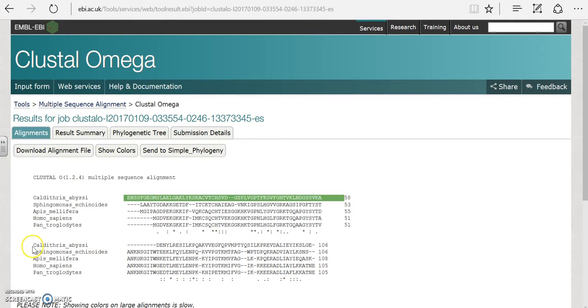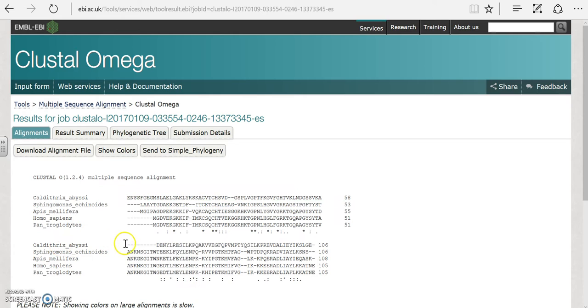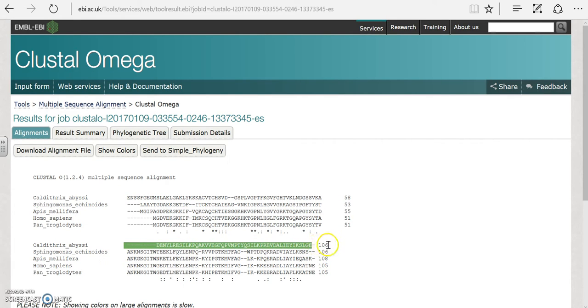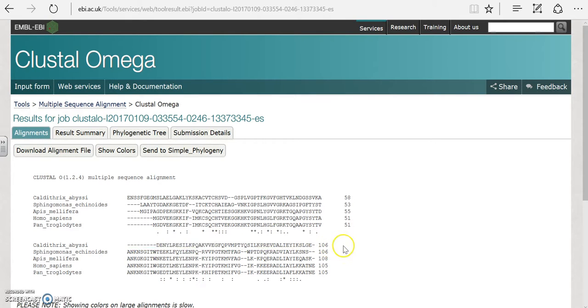Notice it continues on down here, the same species. This is just a continuation, continuing the counting going all the way up to 106 amino acids.